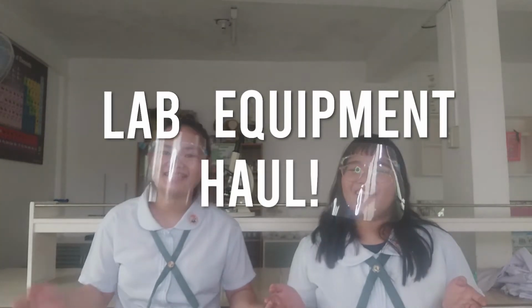Kim, it seems that we're not having our usual upload today. That's right. But we're going in for another type of haul. A haul? Yes, a haul. But this is not your usual type of content. This is not stationary though. Because it's a lab equipment haul! Or to be more specific, those laboratory tools and equipment we have to familiarize ourselves with before we battle our way to our lab classes.